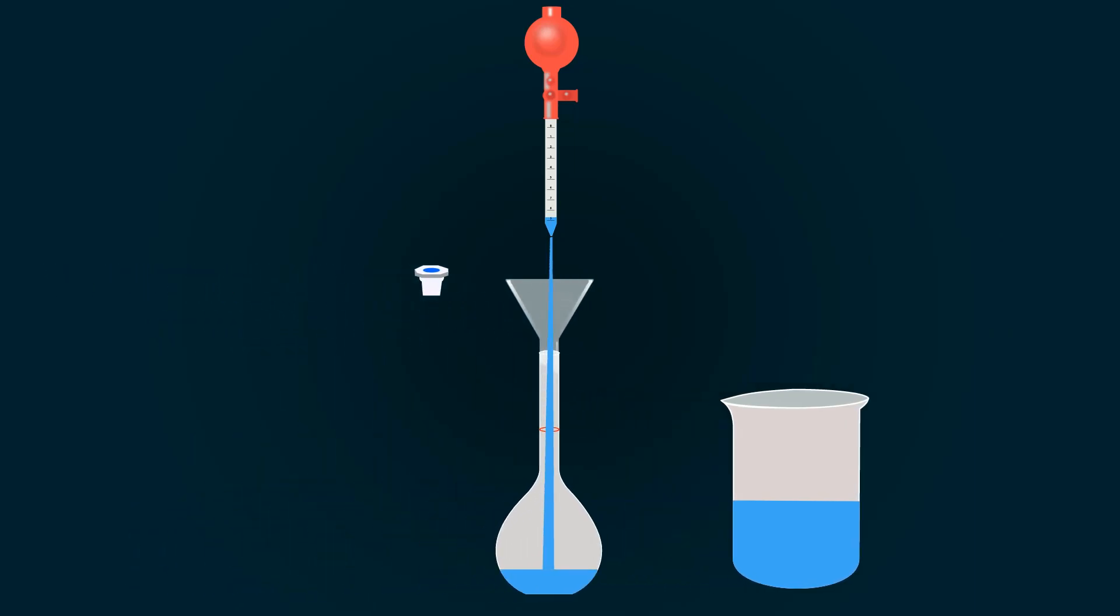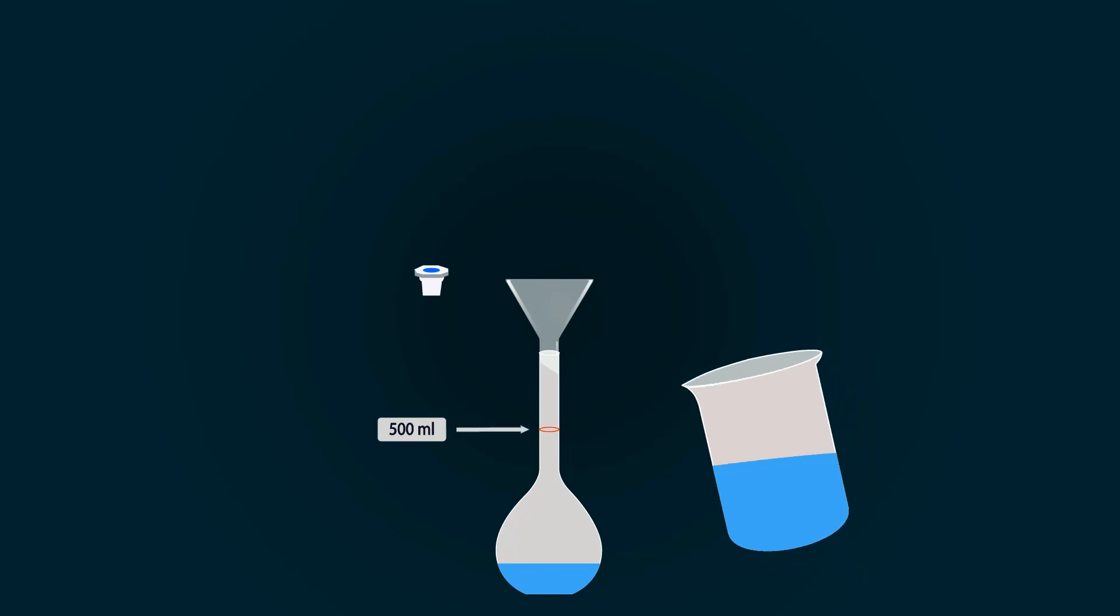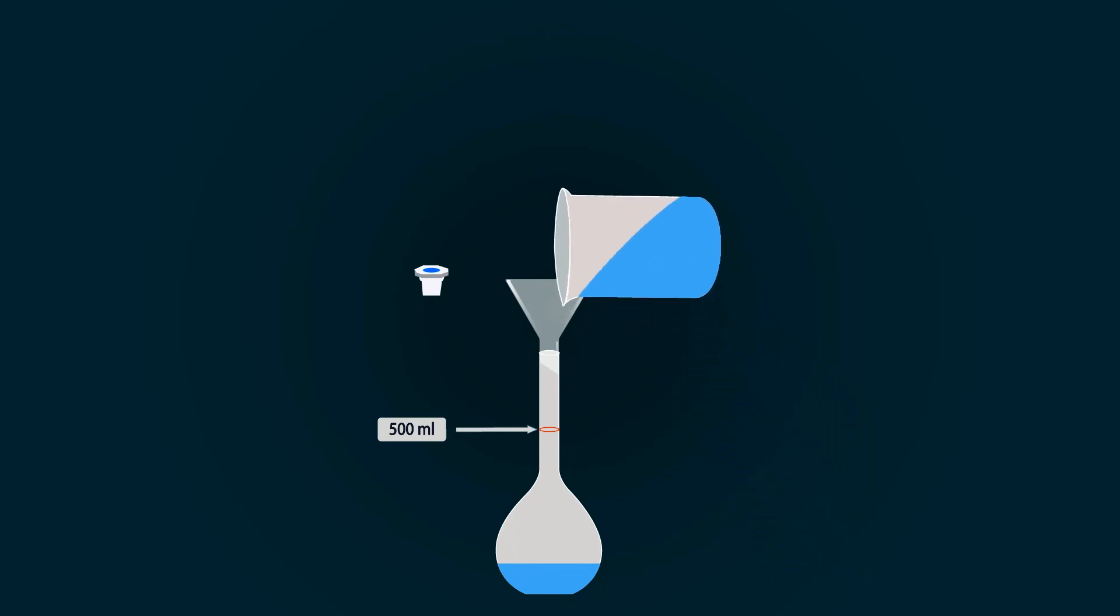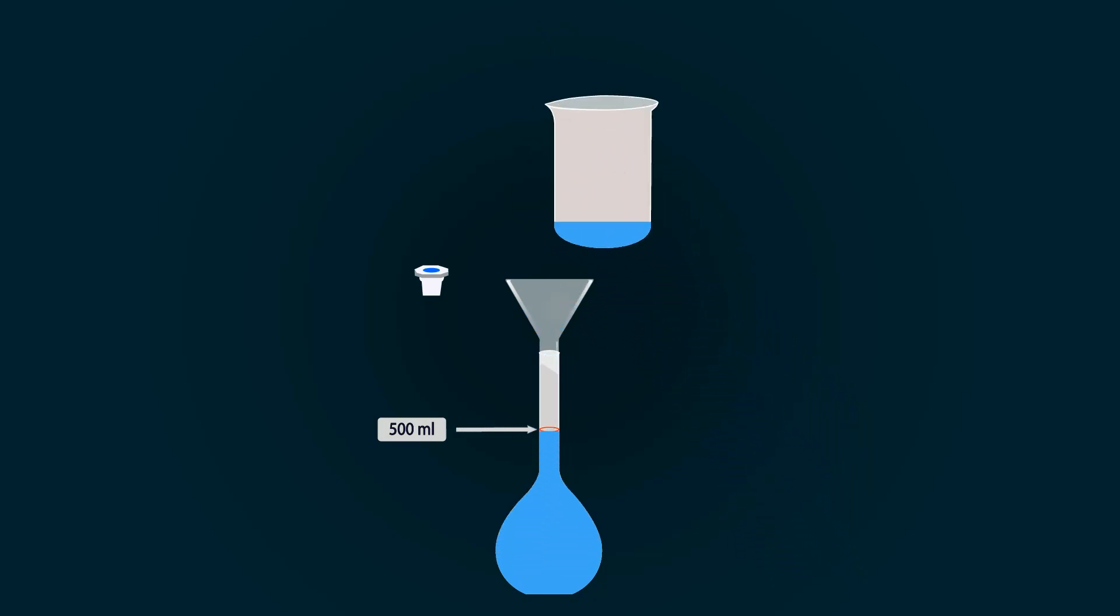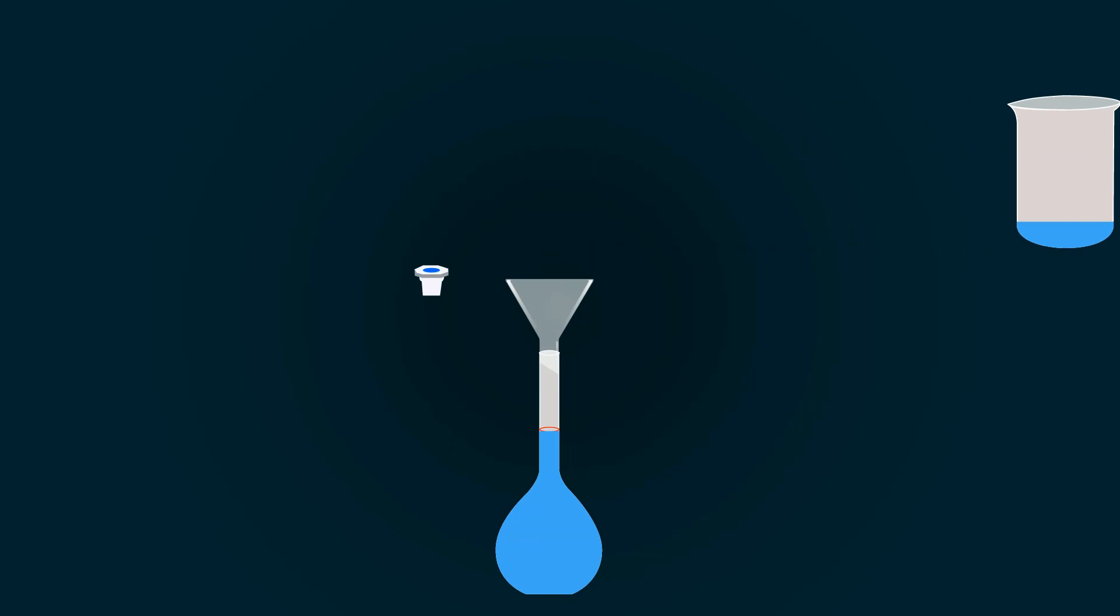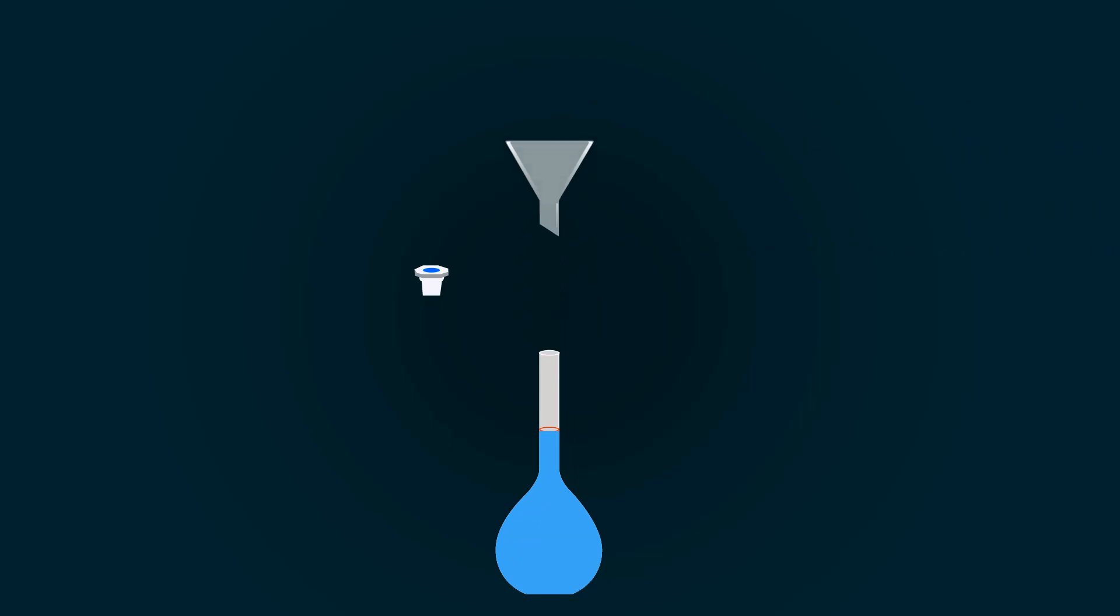Now add distilled water to fill it up to the 500 milliliter mark. Close the volumetric flask with the cap.